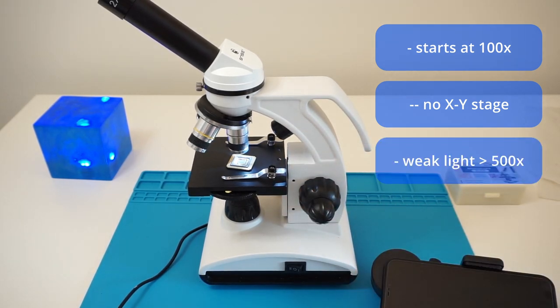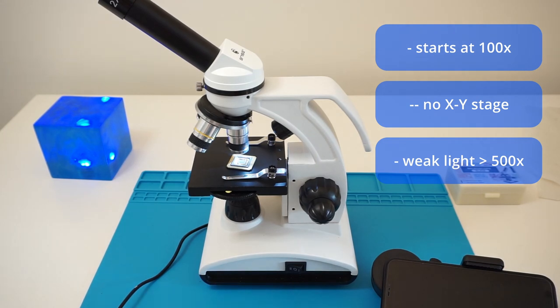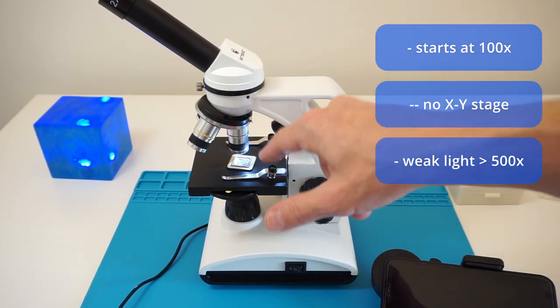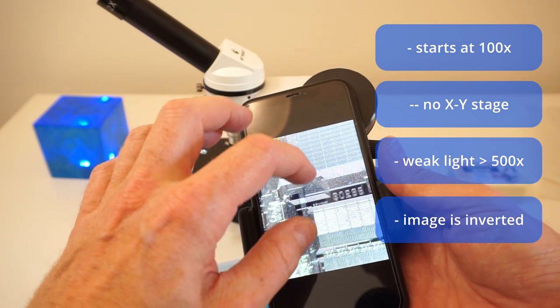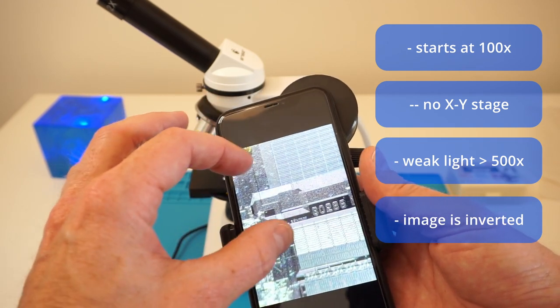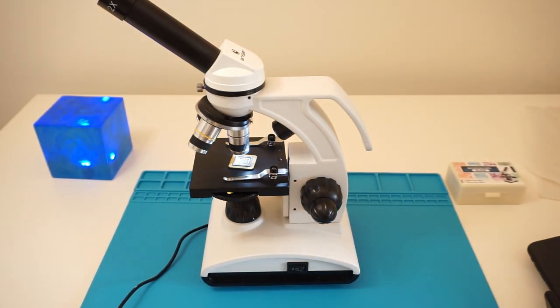The third issue that the microscope has is, if you want to go to higher magnifications, such as 500 or 1000 or 2000, you really need an additional light source. Otherwise, this small lamp will simply not shed enough light. There will be shadows created by the system, and then you cannot enjoy the high resolution of 1000 or 2000, which you really require. So the final drawback is that you can take pictures, but you have to invert them in order to see the letters or the numbers the way they were meant to be. And it makes it difficult to navigate, to really find some interesting spots of the CPU. I would in general recommend it as an entry-level microscope.